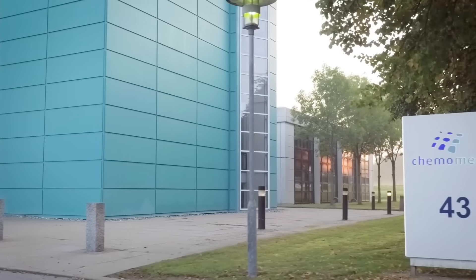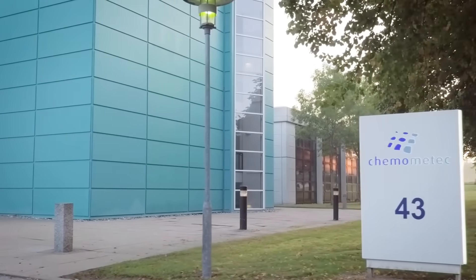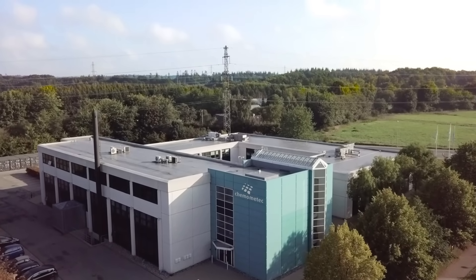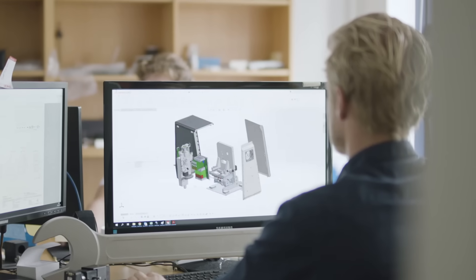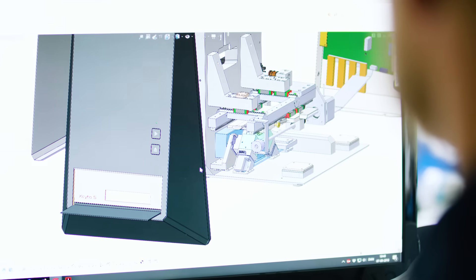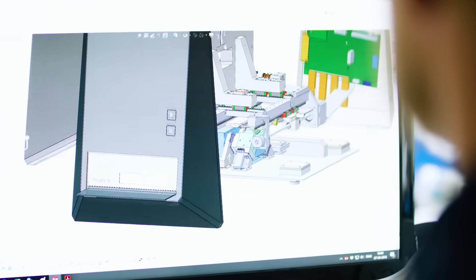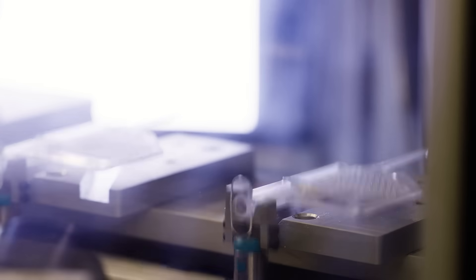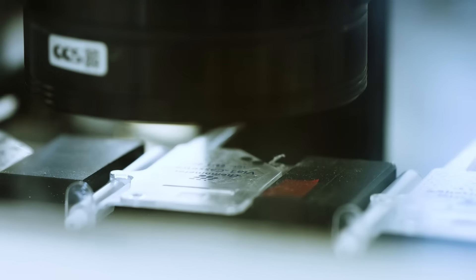ChemoMatic is committed to supporting scientists. Our automated cutting-edge instruments make complex analytical processes simpler, more robust and more cost-effective.